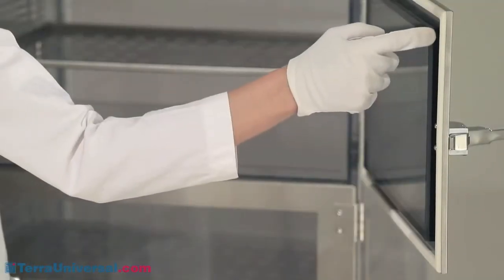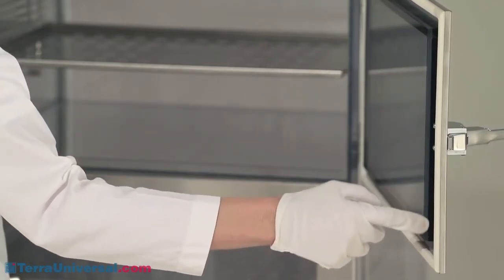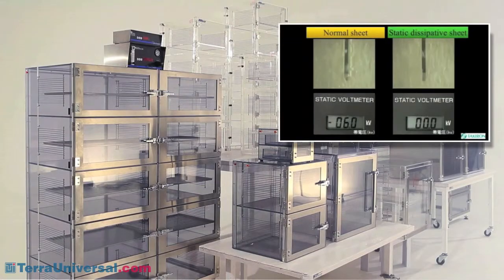The plastic doors feature a double-wall design that enhances rigidity and strength for a better seal. Acrylic models provide strength and visual clarity, but are not suitable for use with alcohol and other strong cleaning solutions. They also allow accumulation of static surface charges, which can discharge onto parts and which also attract particles.